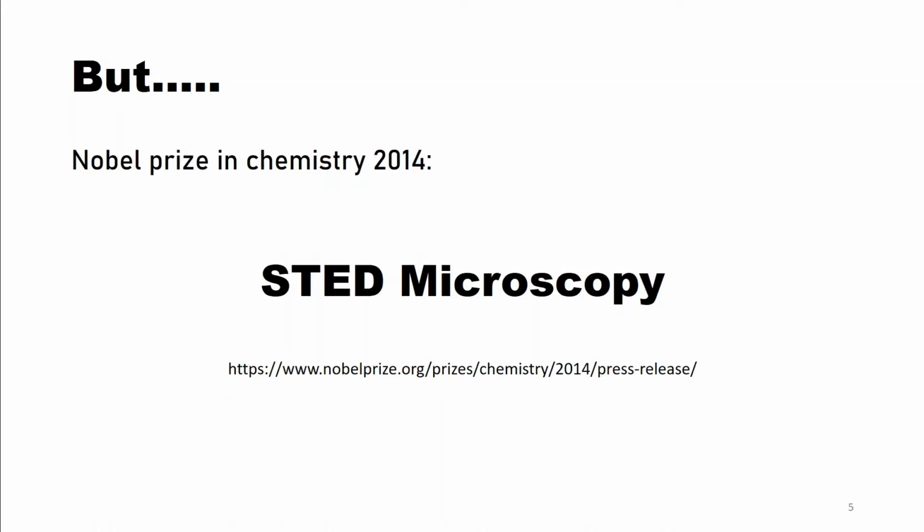That is possible due to the sample that emits fluorescent light after it was excited by an external light source. But I will not go into the details here. If you are interested, Wikipedia gives a nice summary about how the technique works and why the resolution is even higher compared to other fluorescent microscopy techniques like the confocal microscopy.